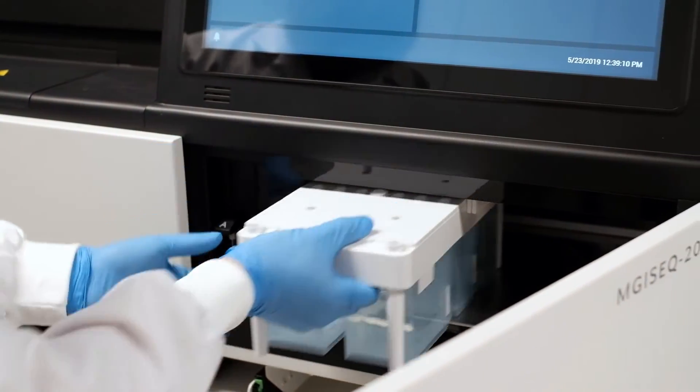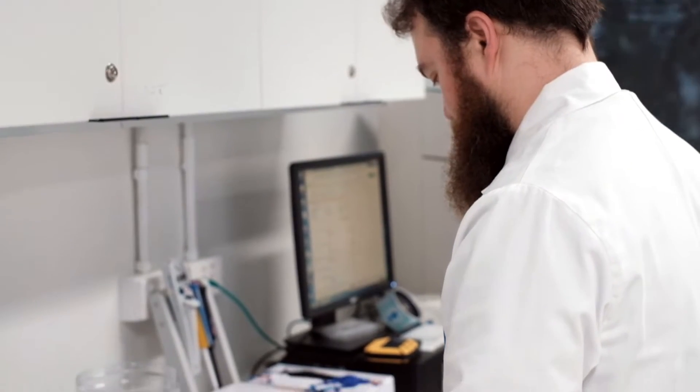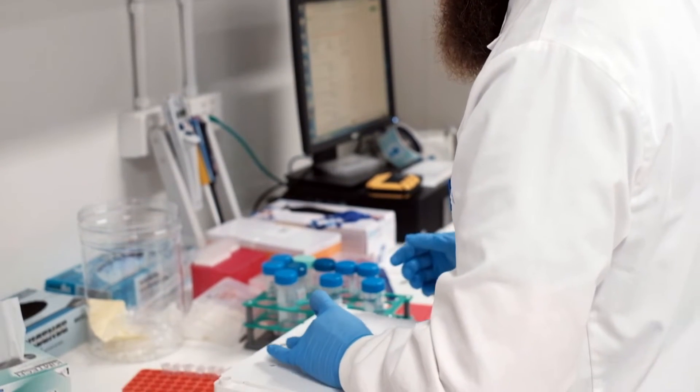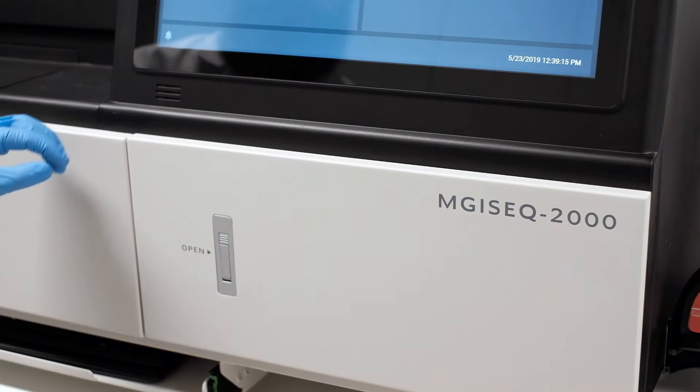The MGI instrument enables us to provide our sequencing data at a much better cost per base and per read, both the instrument and consumables, than we could ever have achieved with our current instrumentation.